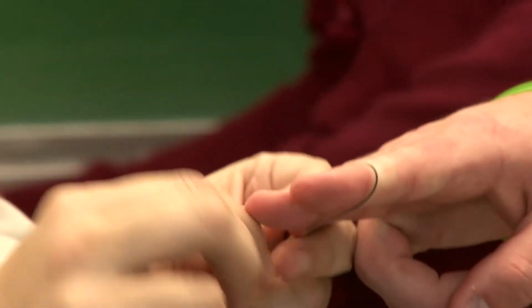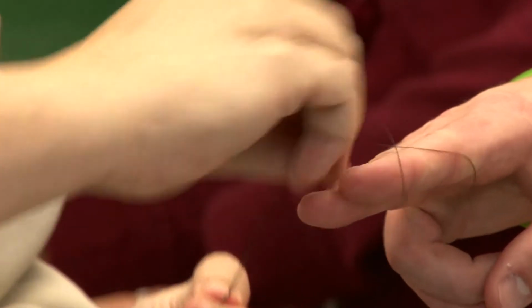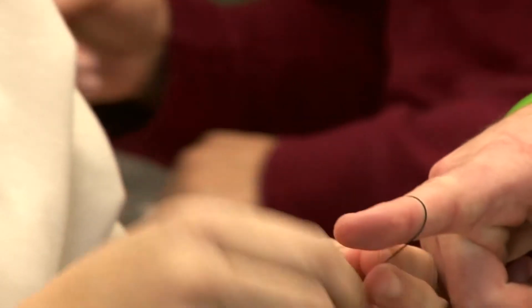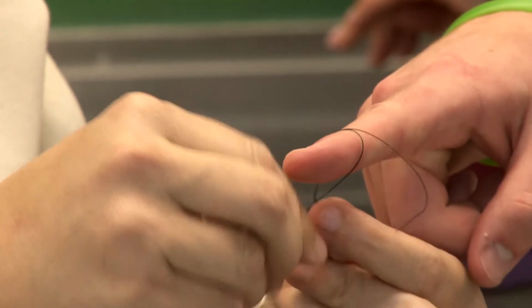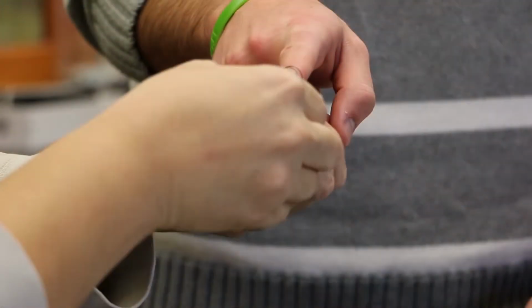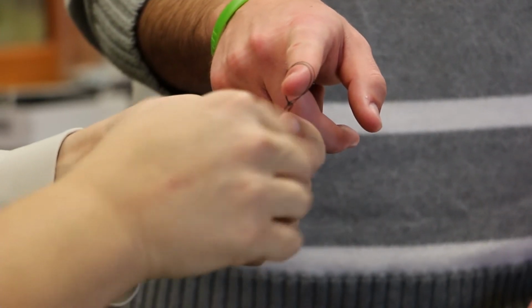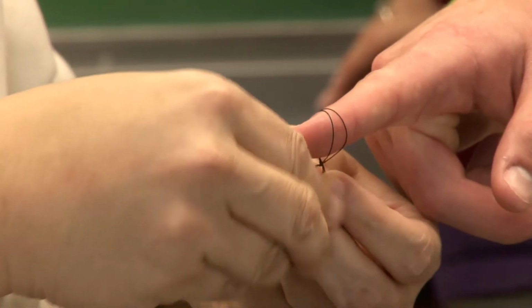So I take somebody's fingers, and again, I want to make sure that I have my 4 inches about. Your fingers are too wide. Give me one. All right. So I'm going to just tie a knot basically around his finger. Now, I don't want to tie it tight, because this is just kind of giving me a guide so I can tie a firm knot. But I'm going to tie a knot, and just so it doesn't become a slip knot, I'm going to tie an extra half hitch. Is that what they're called when you do half of a knot?